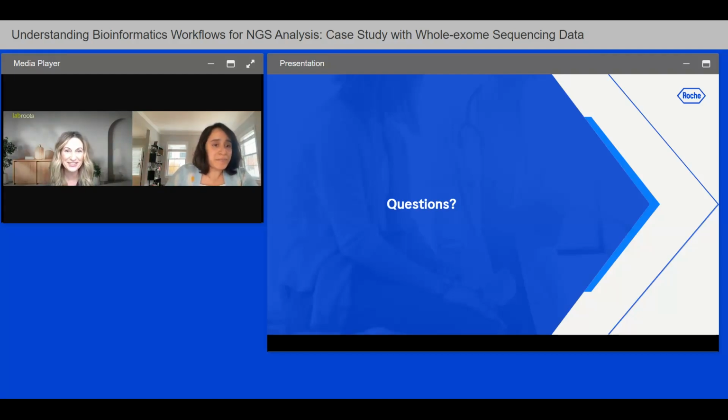Very good, thank you. We have this submitted question. What are the system requirements for the container solution? What our team has done is we've built a container solution for this whole pipeline. Since we already have open source tools, what would be required is we are using Singularity to build this whole container solution. So you would require Singularity to be downloaded and also basic command line Linux.